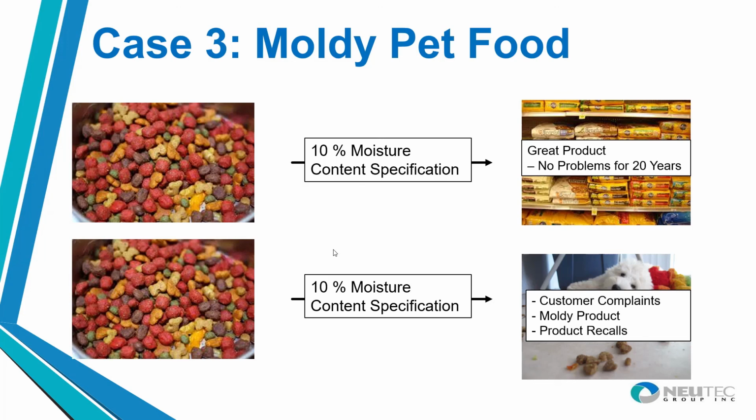And again, as with the last case, this would have never happened had they been measuring water activity, because moisture content does not control microbial growth.